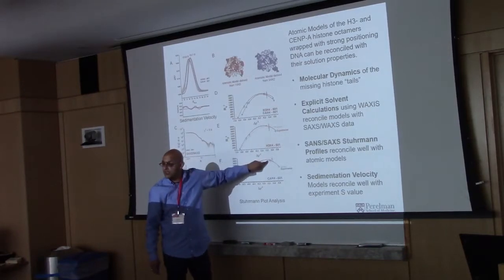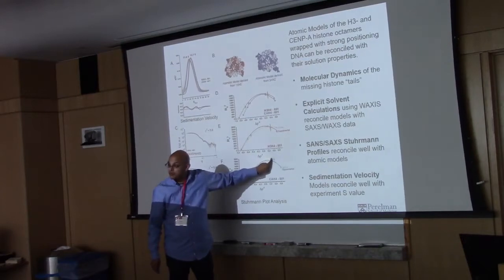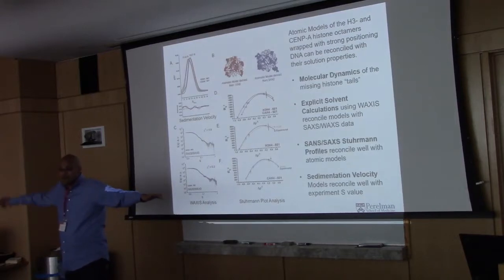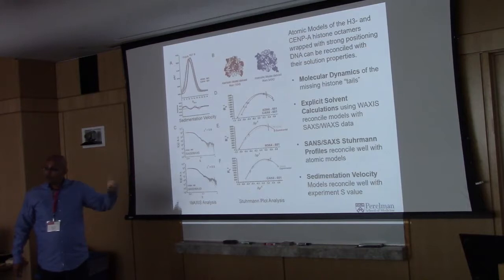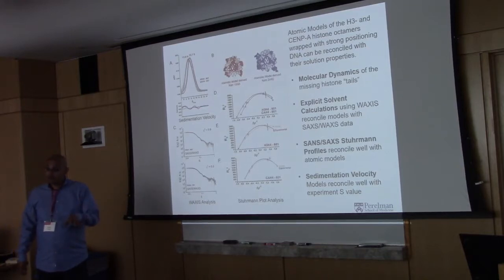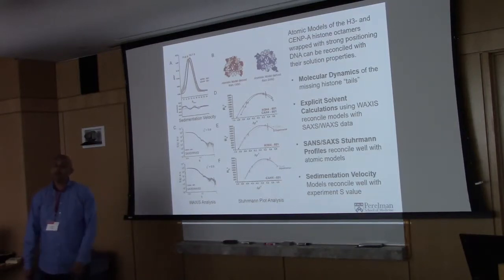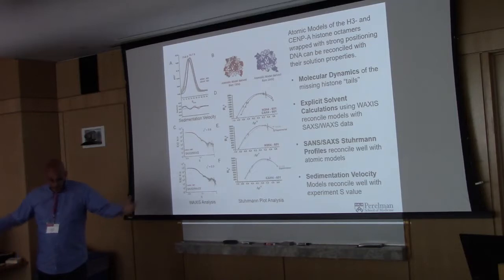And you put all of these Stuhrmann plots together and overlay them. They all cross right here at the X-ray point. But at these different contrast points, they all vary. It's the contrast variation that's revealing the differences, which are otherwise not resolvable by the X-rays alone. Originally I scattered this by X-rays, and oh my gosh, these are all the same. But when I did the neutron experiment, that's when I'm like, holy moly, these are really different.